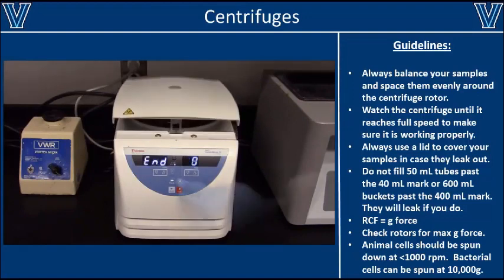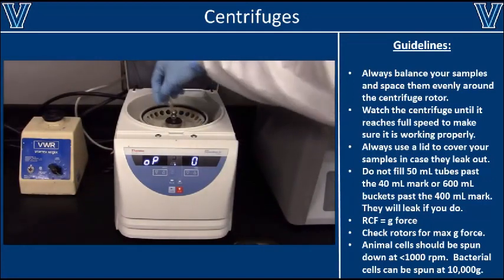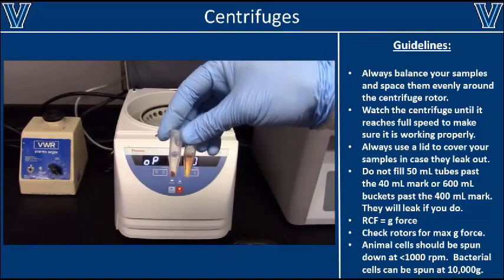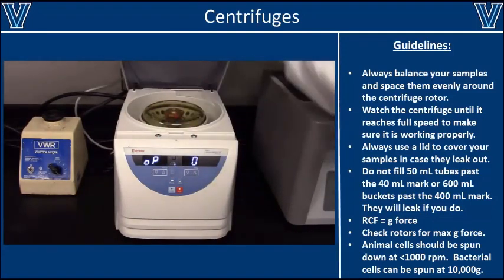Once the centrifuge has finished, wait for the rotor to completely stop spinning, then remove your samples. You should always check your samples to make sure the desired sedimentation has occurred. When you're done with the centrifuge, put the rotor lid back in place and close the main lid.